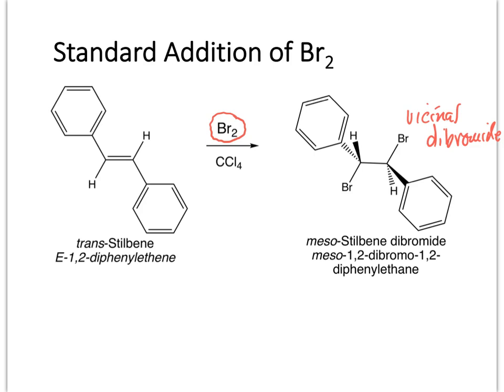And before the student realized, it had burned a hole in the student's skin down to the white connective tissue layer underneath. And a chemical burn like that is very painful and very slow to heal. So we try not to handle molecular bromine any more than we have to. So there's one problem. Making the solution would require us to use a lot of molecular bromine. Whether it's endangering the students creating those solutions, it's creating more danger than we would like in the preparation. So if we can avoid using that amount of molecular bromine, we do.